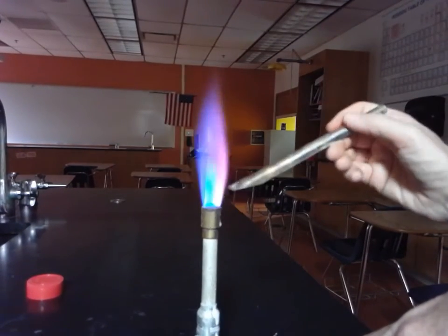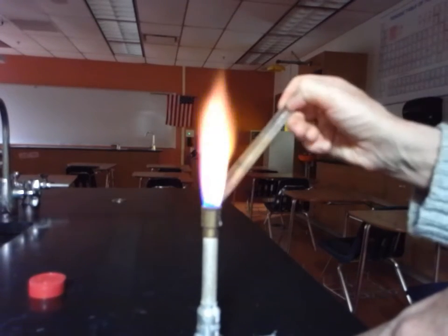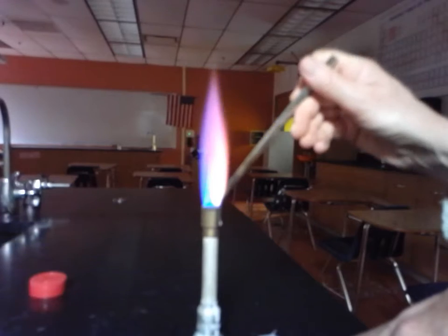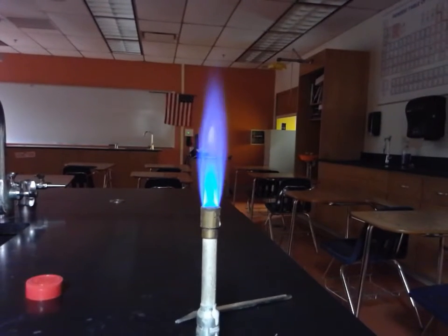Almost there. A little bit more. Do not do this at home. Perfect. Back to blue. Okay. That was lithium. I also snapped a picture of that, and I will post those also, so you can see the clarity.